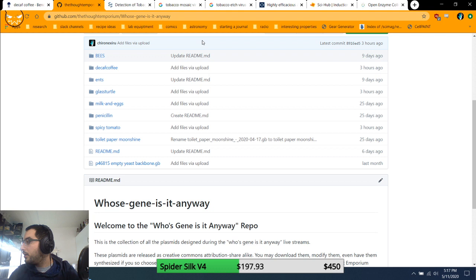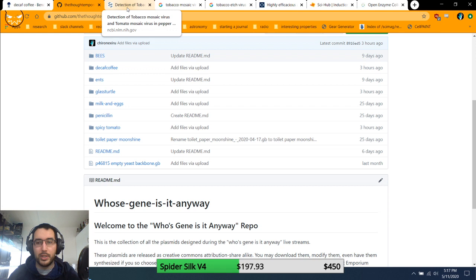The Qubit is still not fixed. I'm still tinkering with it. I got some stuff to try and fix it. It didn't fix it. So at this point, I basically have to physically open up the device, check all of the stuff, take some really high-res pictures of the circuit, and send it off to my circuit friend, who is like a god of electronics, and hopefully he'll be able to sort that out.